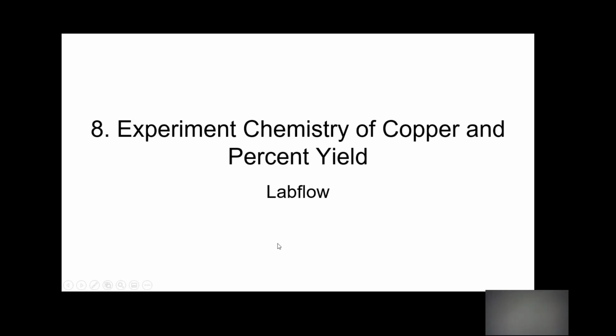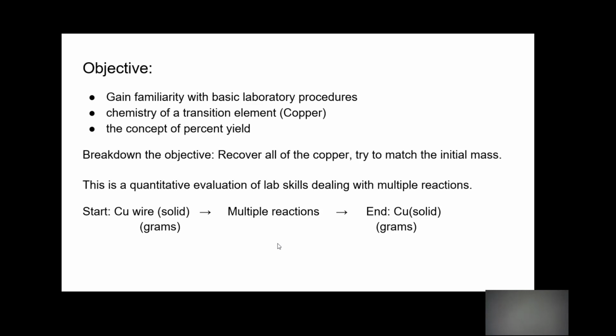Hi class, this is the experiment on the chemistry of copper and percent yield. I've tried to simplify this as much as possible. What you're going to do in this lab is start out with copper wire.